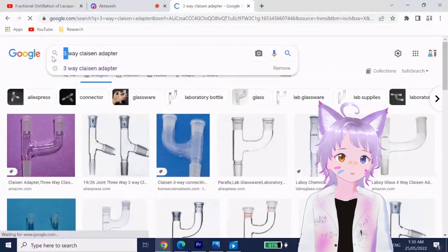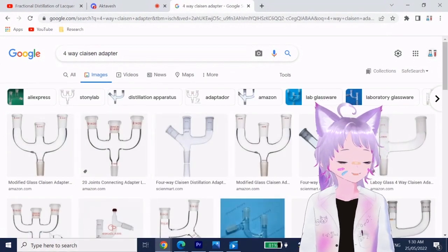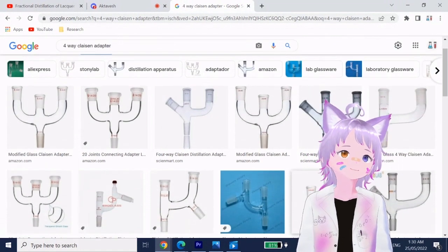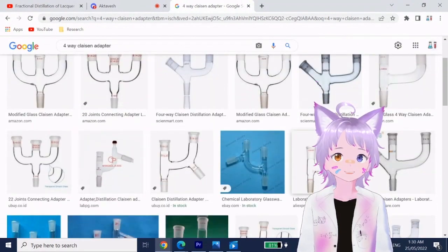Oh, you have the three-way version, right? Yeah, this is what I'm saying. If you have a three-way Claisen adapter as well, you could do the sulfonation with an addition funnel with the sulfurics. Like, that would actually be nice.